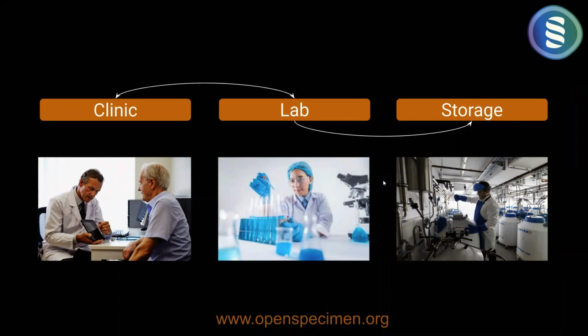And the other critical use case is the ability to scan a barcode. So if your tubes are barcoded, if your boxes are barcoded, etc., you'll be able to just scan, look at it, and then make sure that you have the right thing in your hand. So these kinds of things are what decides. Whereas if you're on a laptop, you can't directly scan or easily scan a tube into a laptop, right? So especially on a browser, there is no way to scan, unless again you attach a barcode scanner to your keyboard and then scan, which obviously then makes it easy to scan.